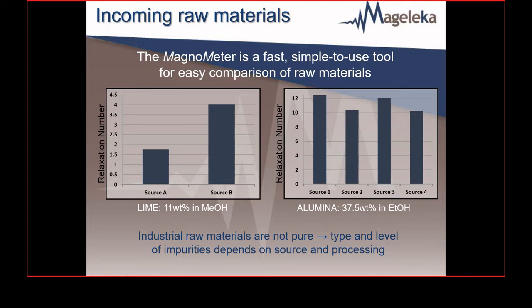So it's clear that whatever mechanical and chemical processing methods were used, it had a major impact on the characteristics of the actual lime itself. The NMR relaxation data presented here then shows that for both types of chemicals investigated, nominally so-called identical materials were obviously not the same. In addition to influencing performance of any subsequent procedures that use them, the potential economic impact of variation in these raw materials must also be considered.